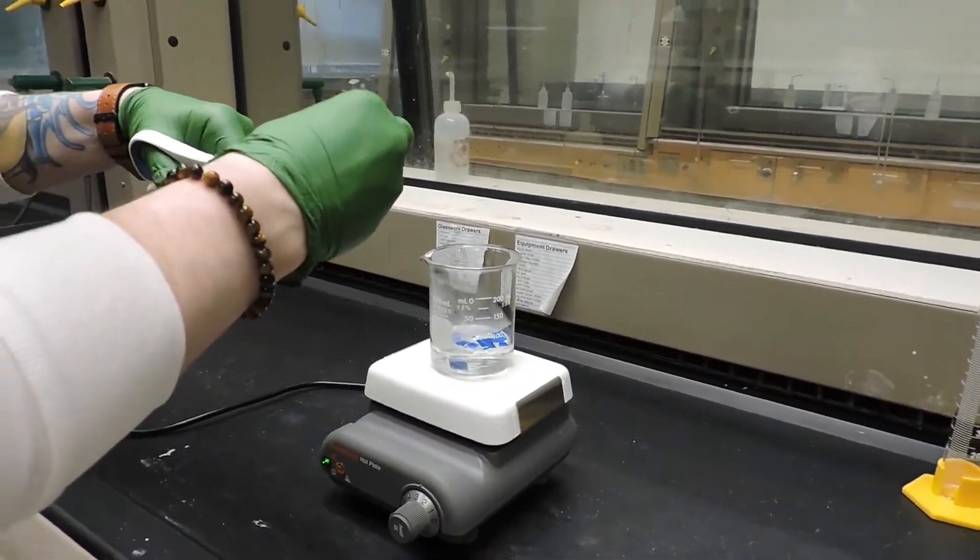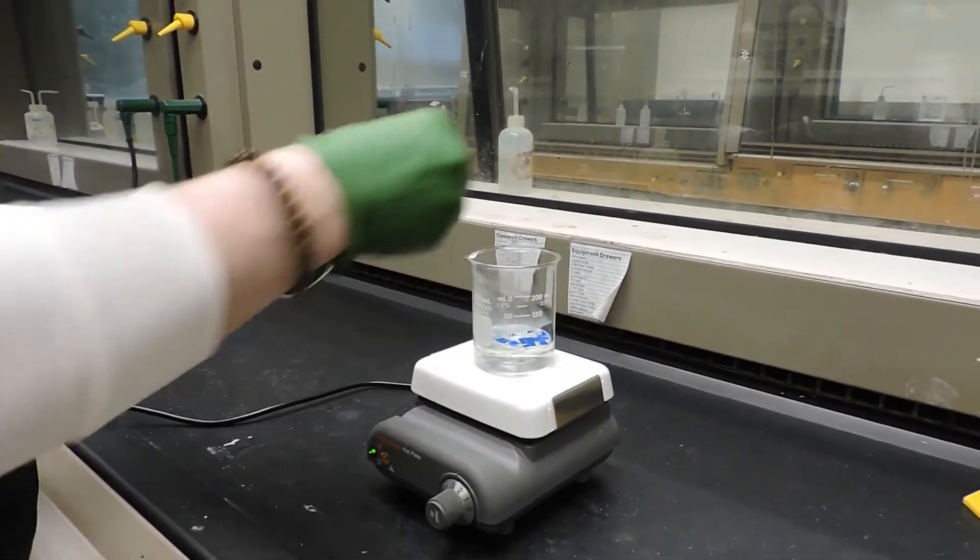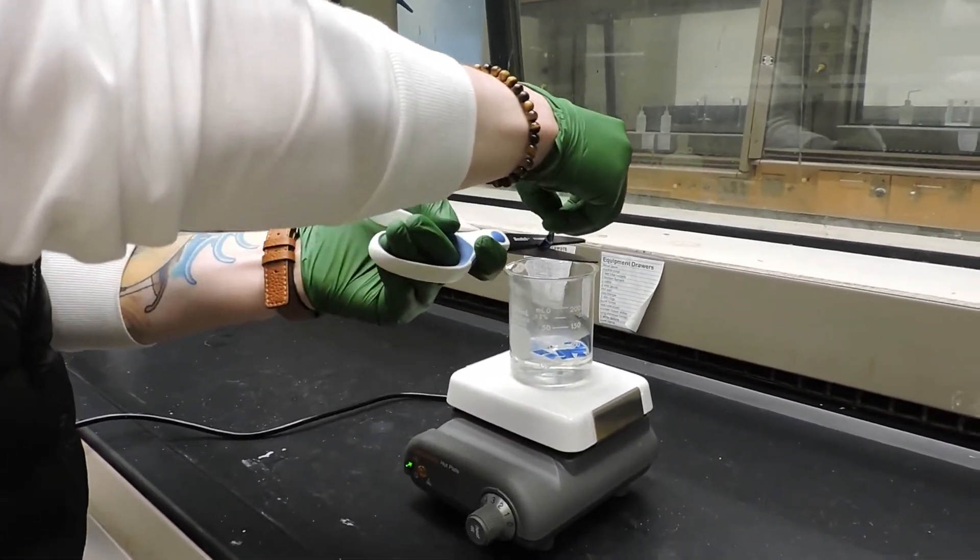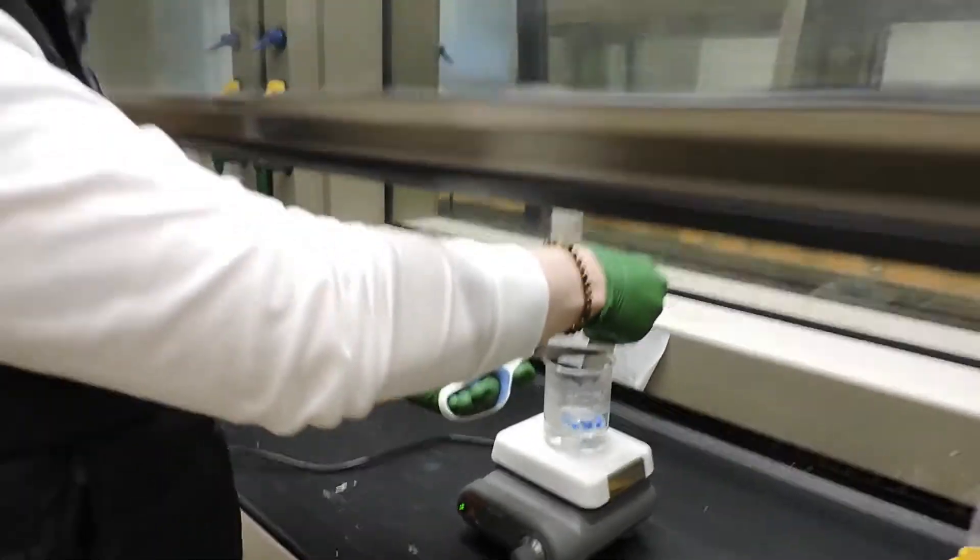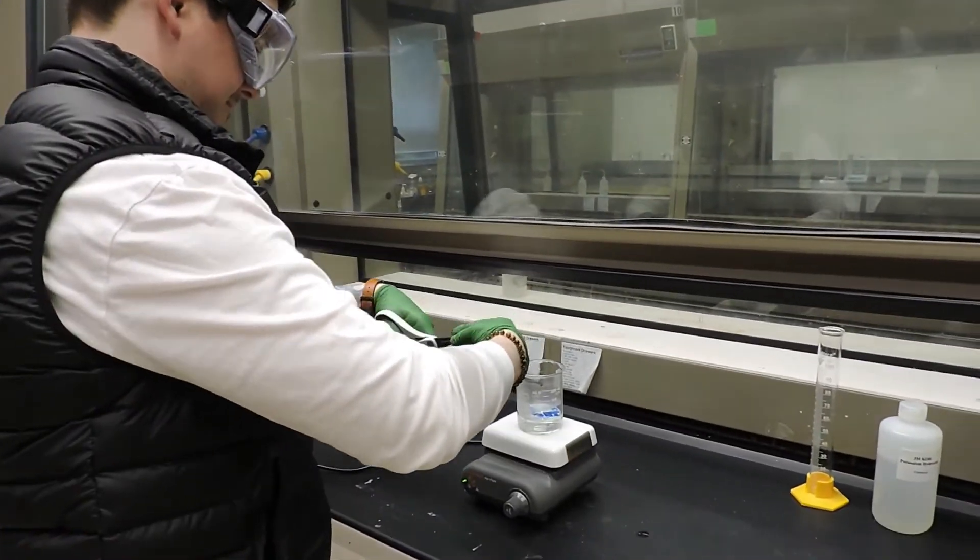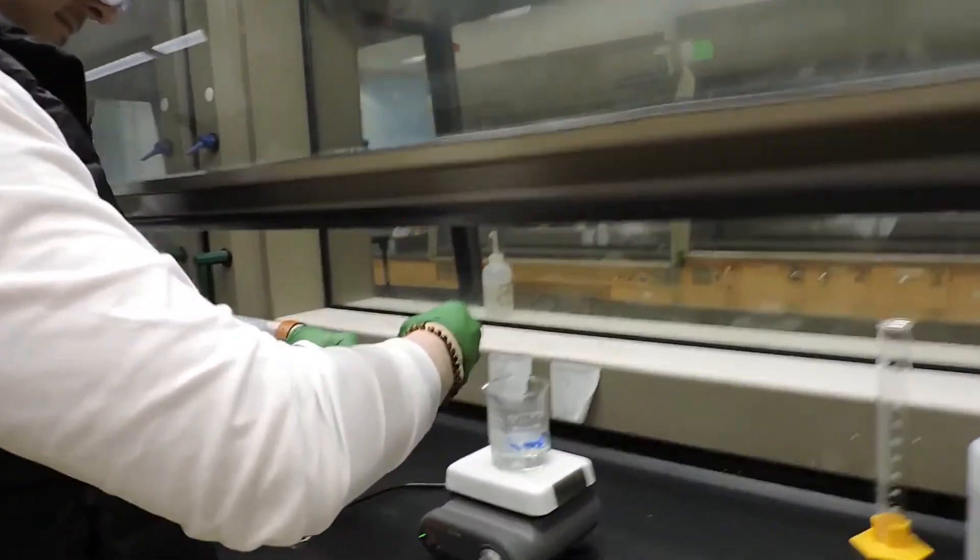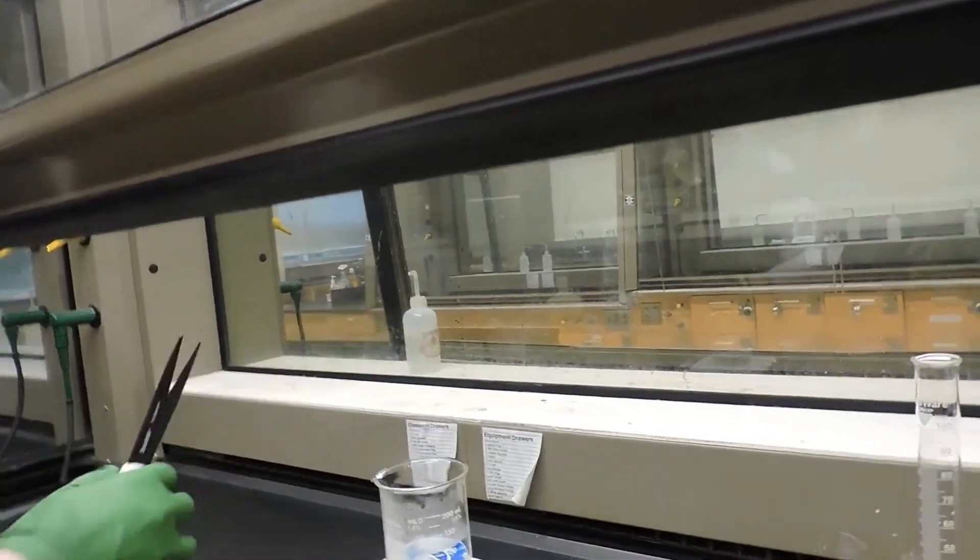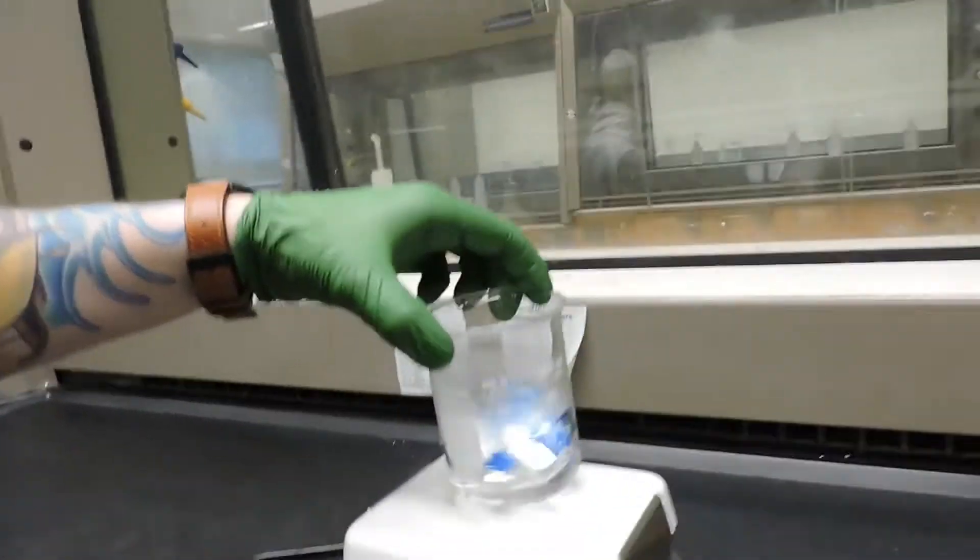On this hot plate, the aluminum is going to dissolve and give off hydrogen gas, which is why we have our sash down because we don't want to be breathing that in. And in about 10 minutes all the aluminum should dissolve.